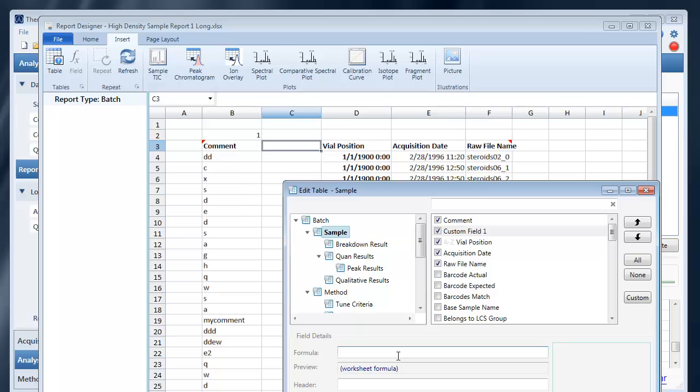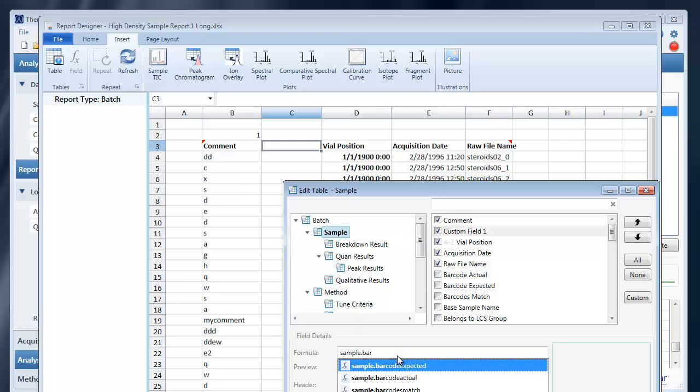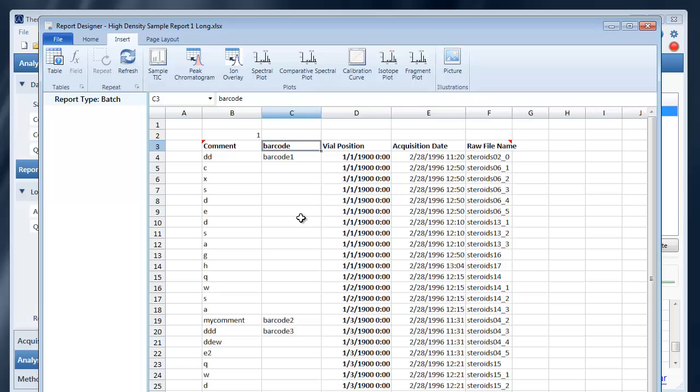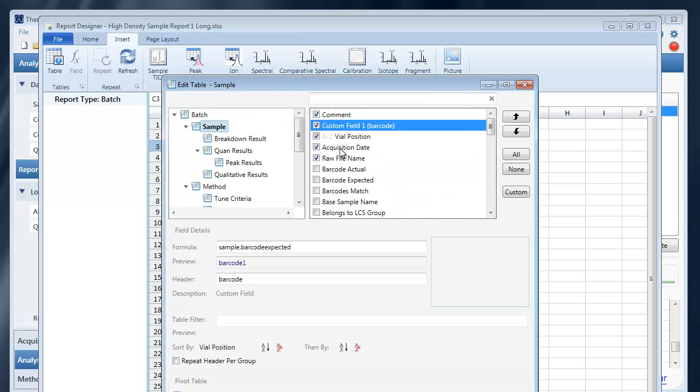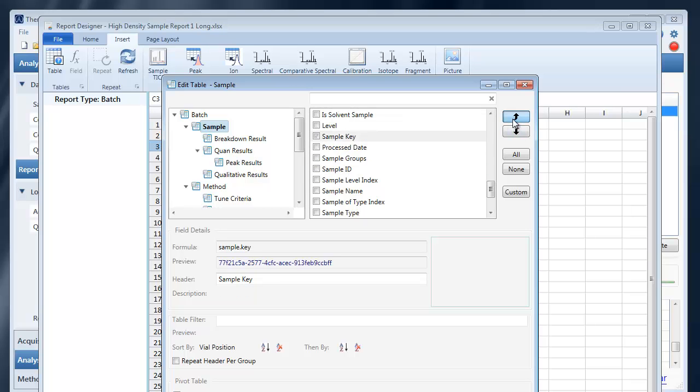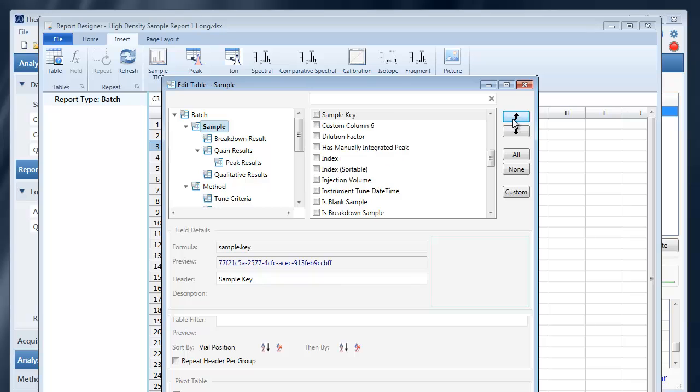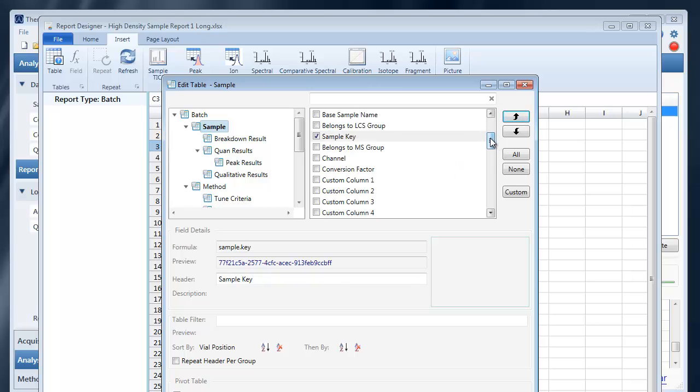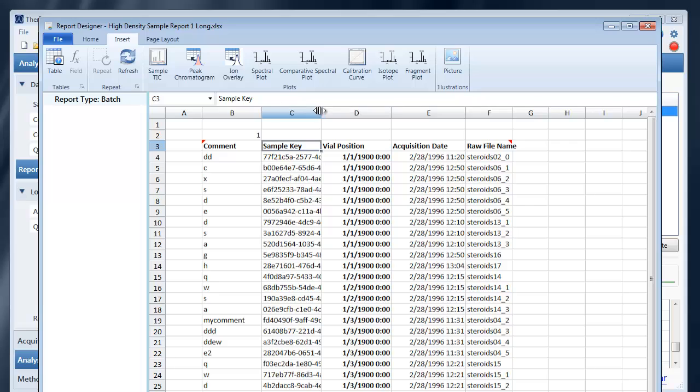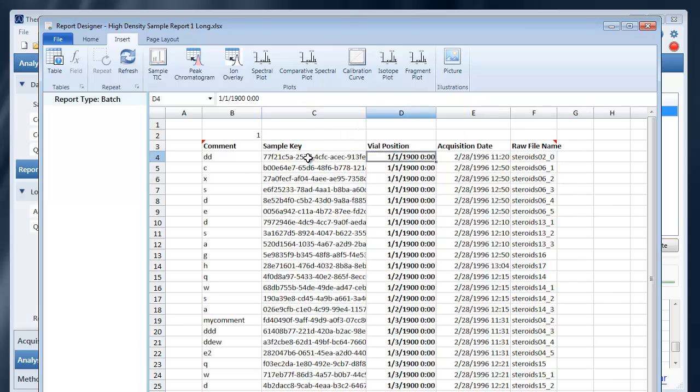I can now either add a custom field into this new position that I added, or I could add a non-custom field. And my formatting for that column will stay in sync.